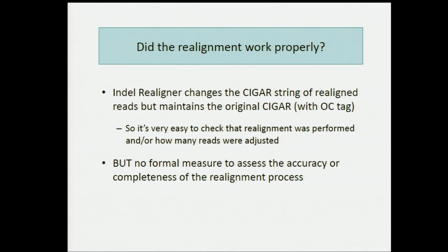But besides actually going for the whole downstream processing, calling SNPs with and without realignment, it's hard to tell you that the realignment worked. But generally, this is a very stable tool. It's been run in the Broad pipeline for many years now without complaint. So the best I can tell you is that it is working.